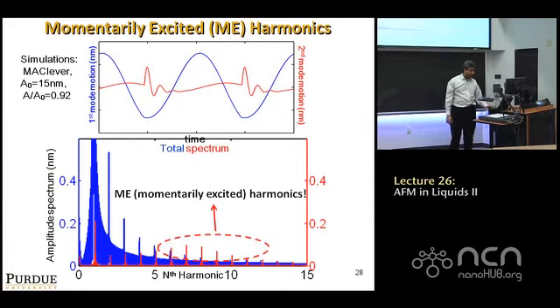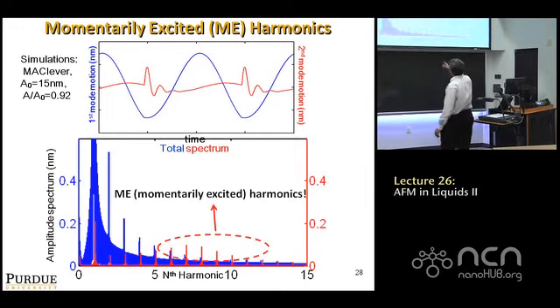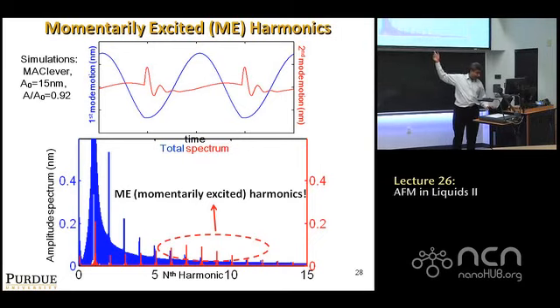So it suggests that if you're trying to capture this little ringing motion, what you measure is a combination of both, right? Because your laser spot is focused on the tip of the cantilever. The suggestion is that if you want to capture that ringing effect, you focus on these harmonics up here near the second eigenmode. Most of the signal you're capturing is going to be due to the red, not due to blue, because the blue dies out and the red starts getting enhanced due to the resonance. So if you focus on these harmonics, then you're likely to capture the ringing, and if you capture the ringing, you've got a metric for measuring local property variation.